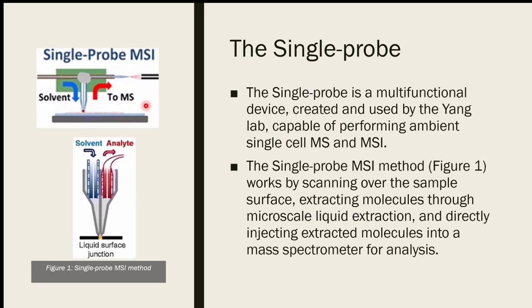Yeah, that's interesting. I worked a little bit with a scanning electrochemical microscopy setup, and it used piezoelectrics. Obviously not the exact same thing, but it's a similar idea where you have a probe that's coming into near contact with a conductive surface, and you use a piezoelectric to move in the X, Y, and Z. And so Arctech, that is a good idea because it may provide you a little bit finer control over the movement of the probe itself.